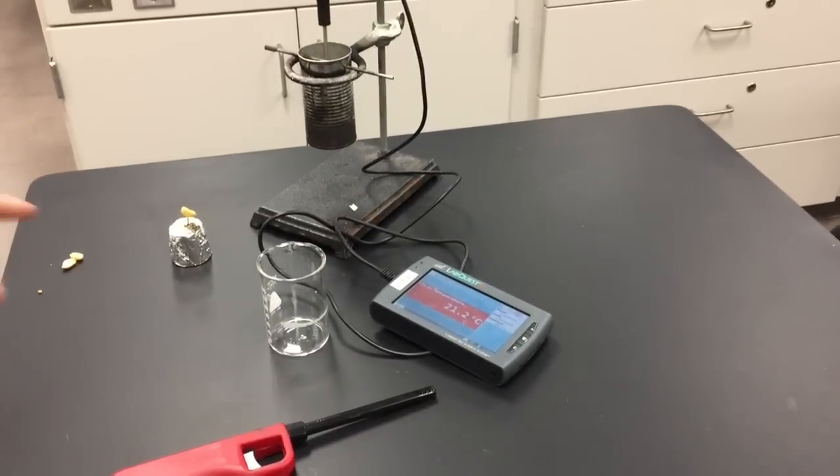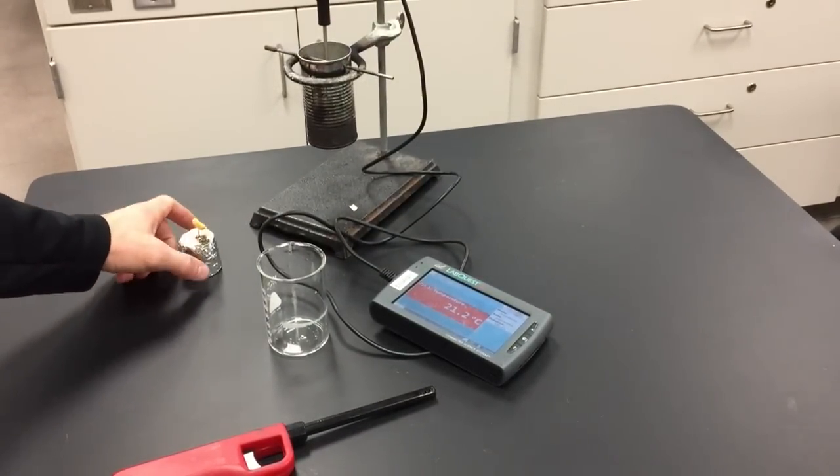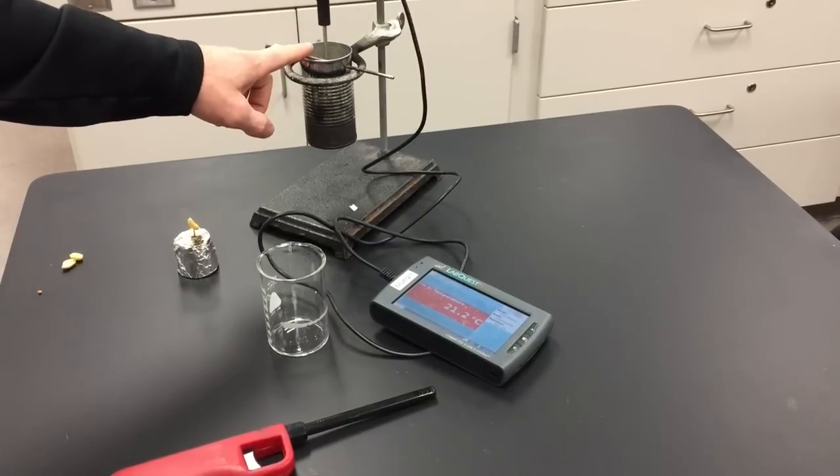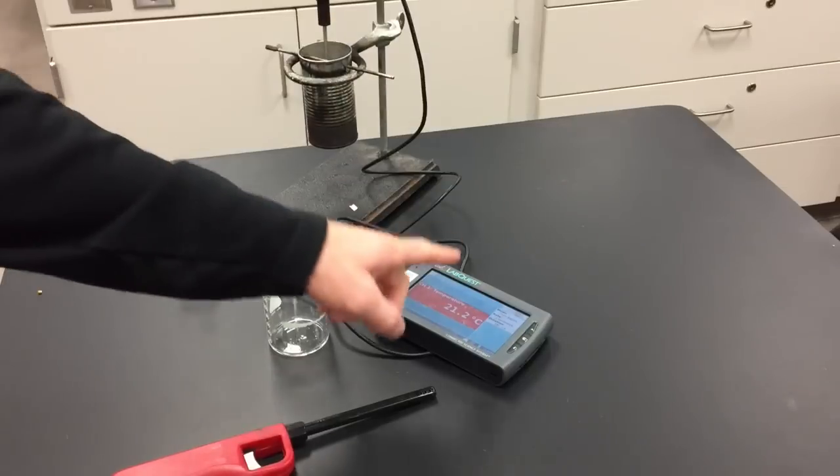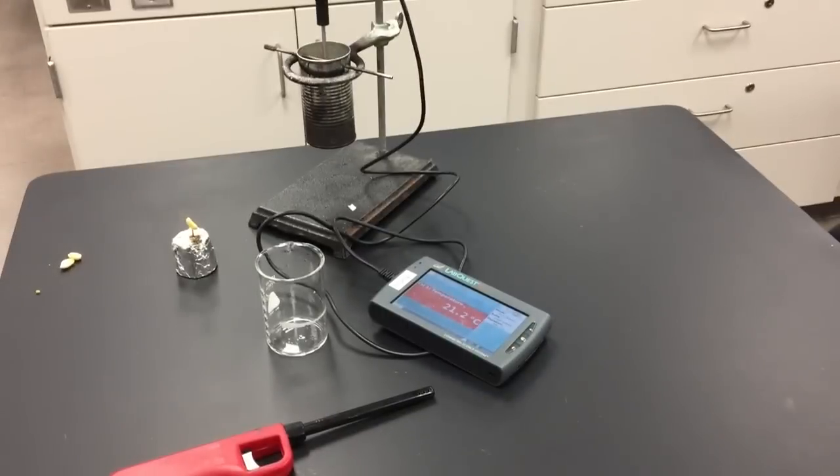This is everything you need to have before you start the burn: the weight of the peanut or whatever food you're burning, the empty weight of the can and the full weight of the can, and the starting temperature of the water. So I am ready to burn the food item. At this point, you will want to make sure to have goggles on.